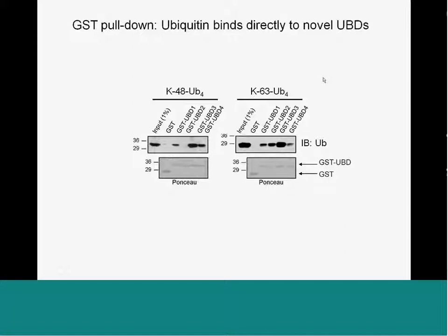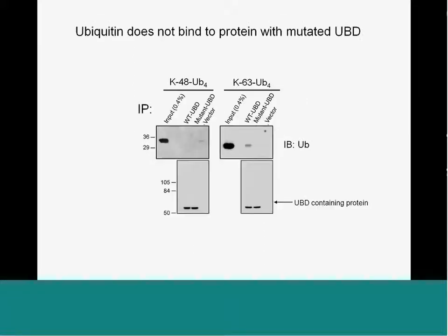And what I'm getting at is that this type of assay is good to tell you that you have perhaps a ubiquitin binding domain, but you need a more sensitive type of assay to actually start getting at preferences, an assay that would be able to give you affinity.